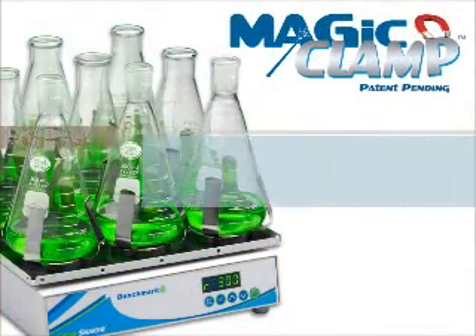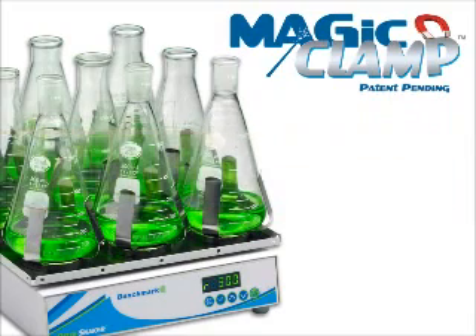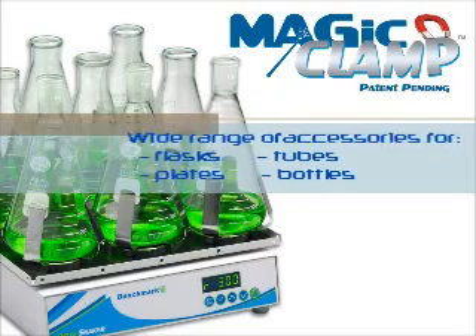The Magic Clamp System from Benchmark greatly reduces the amount of preparation time associated with orbital shaking and offers flexibility over a wide range of applications.